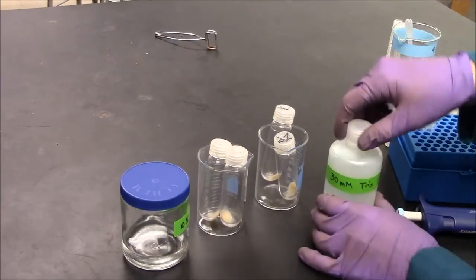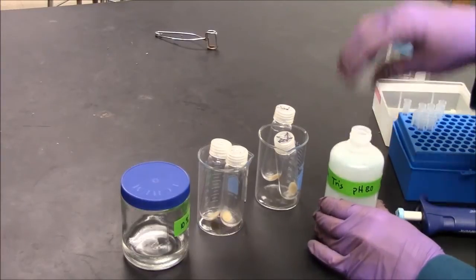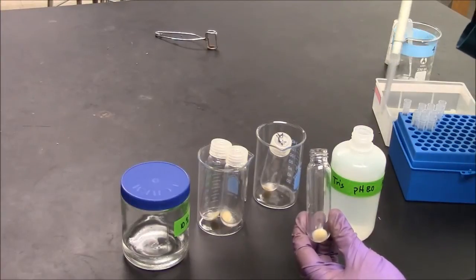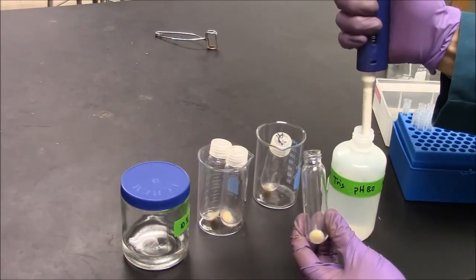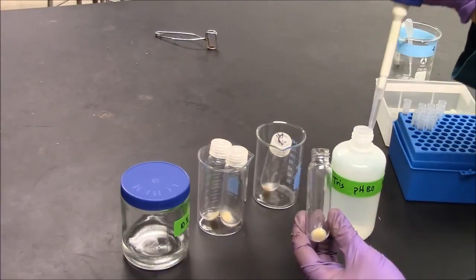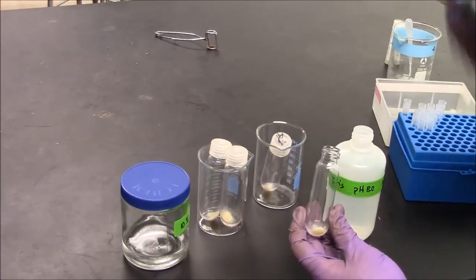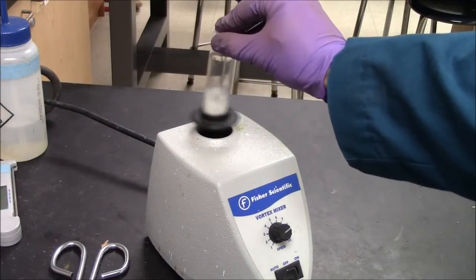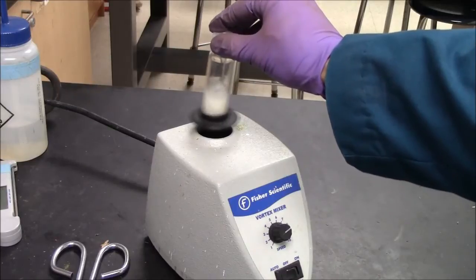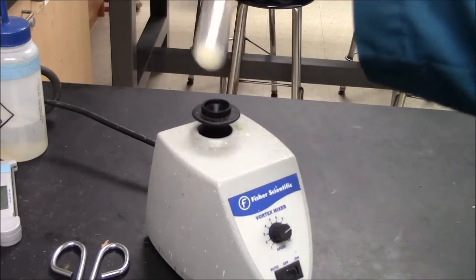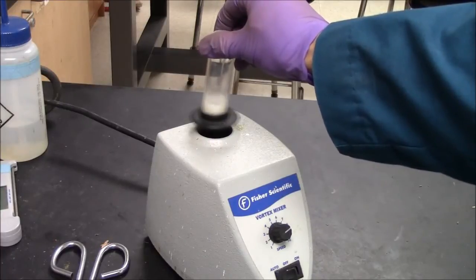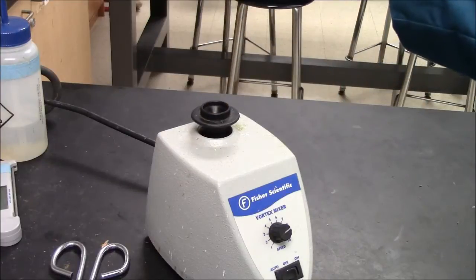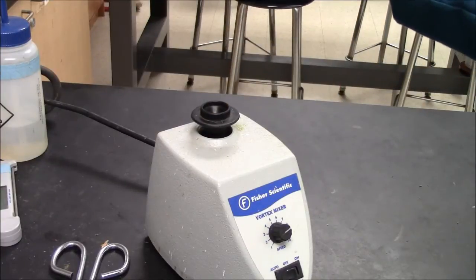Now I'm resuspending the cells in 30 millimolar Tris buffer pH 8.0. So the purpose of this buffer is to wash away traces of the Luria broth. So here's my milliliter. I can vortex this. I vortex it at a pretty high speed. And I observe there's still some pellet. That looks pretty good.